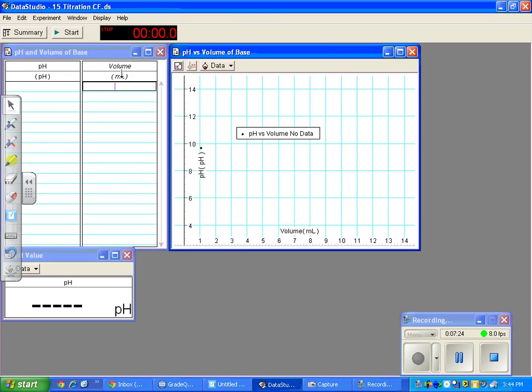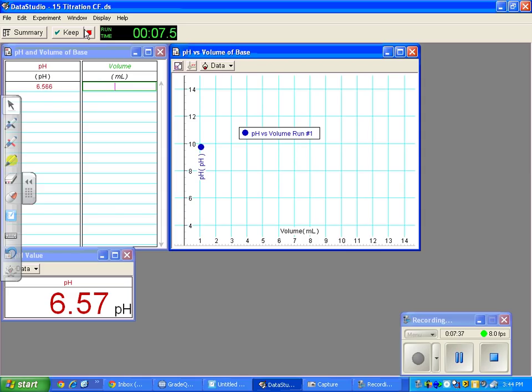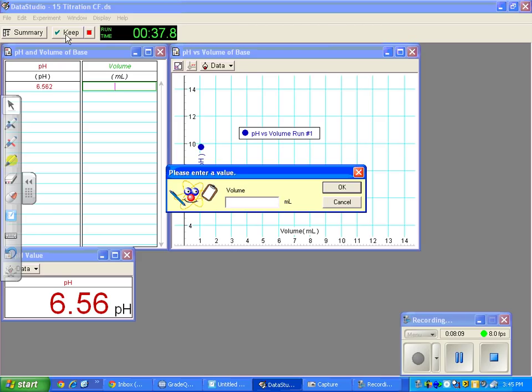Now, how do you use the software? I have it loaded on the computer here and it looks pretty much the same on a Mac. Click Start — once you do, the Start button changes to Keep. Each time the pH stabilizes and isn't fluctuating much, you're going to click the Keep button. When you click Keep, a dialog box appears asking for the total amount of base you've added. You need to keep track on a side sheet of paper. Before you've added any base, the first value you punch in is 0.0, then click OK.